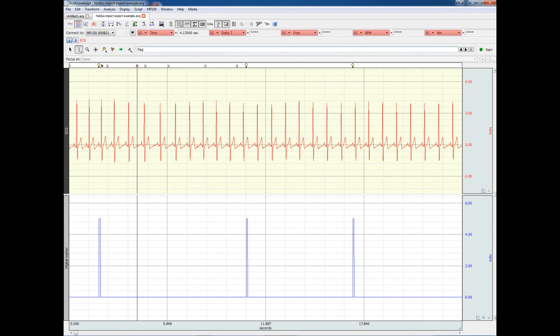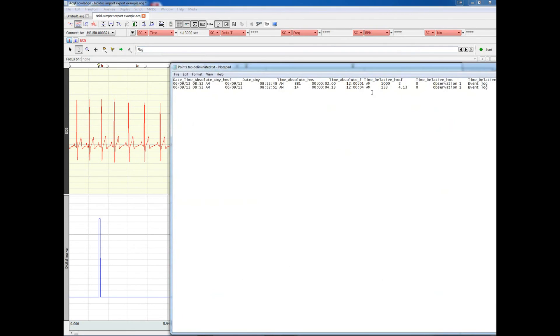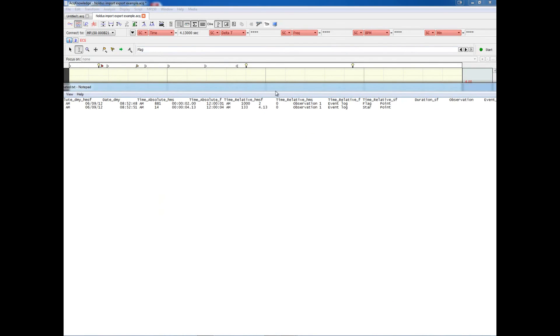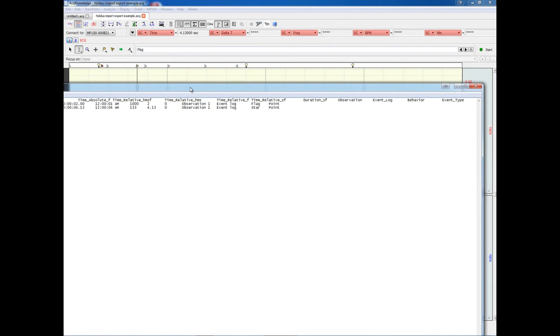If we look at the source file, this is what it looks like. Again, tab-delimited text file, and here we have the label of the event, as well as the time of the event.